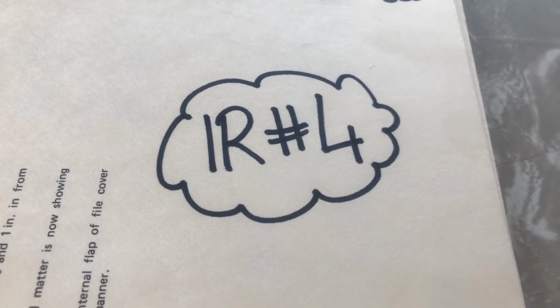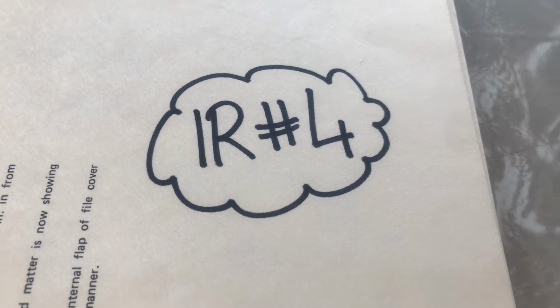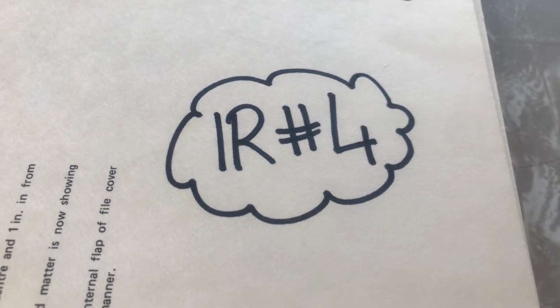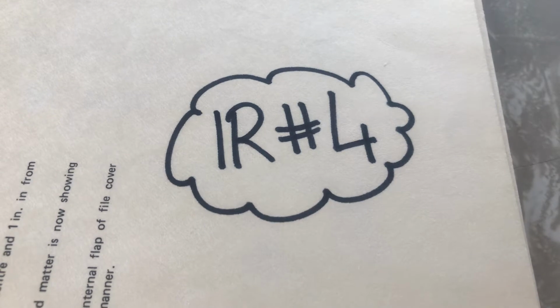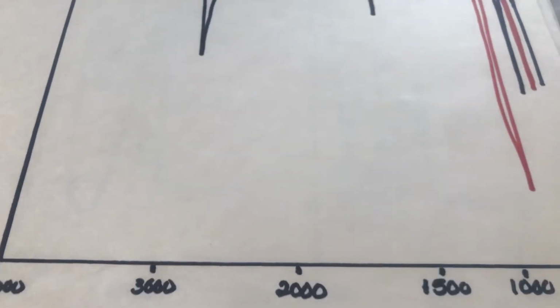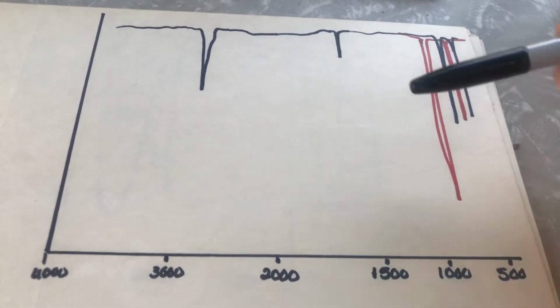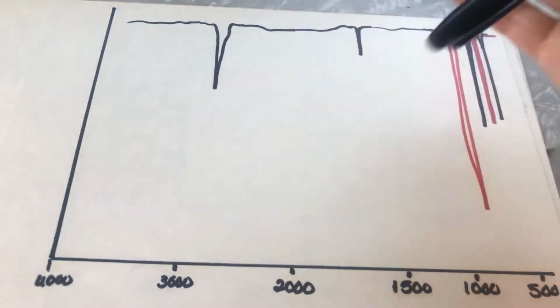Right, one last video on infrared spectroscopy, number 4, and we've just got a couple of loose ends to tie up. So we haven't done alkenes or haloalkanes. So let's return to the spectra here. You'll notice I've just varied the way I've done my C to H peak.